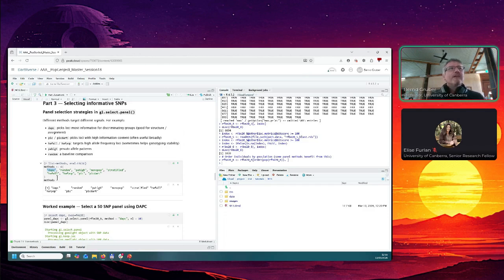I'm a fan of this one, that's why I have to explain it. What is the idea? We thought about what would be a good way to look for SNPs that identify structure. DAPC is normally a nice method because it finds SNPs and orders them in terms of their ability to discriminate between populations. That's cool, because obviously that's what you want: the ones which are very informative to separate populations, in some sense to make a PCA where all the dots are as separated as possible.